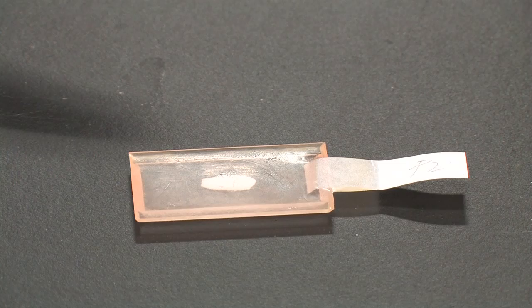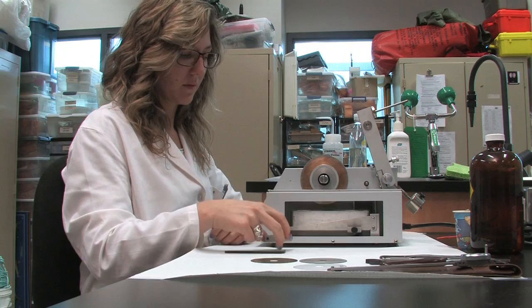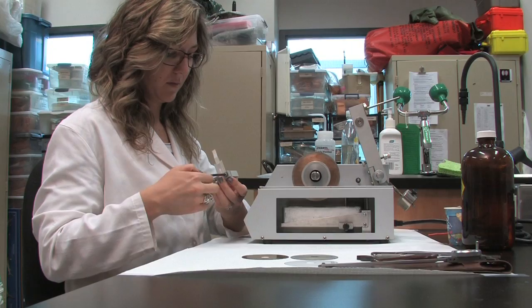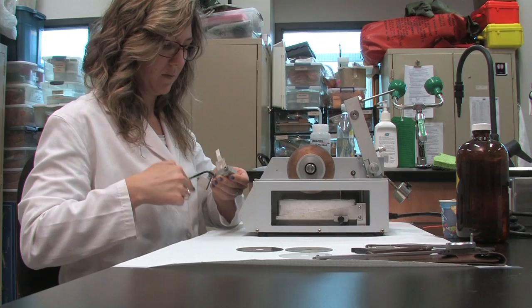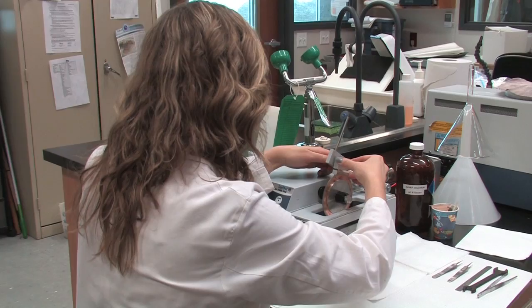Individual otoliths are typically embedded in epoxy first. Preparations for embedding otoliths in epoxy molds will be described in a separate video, Individual Embedding of Otoliths in Epoxy Molds. The epoxy provides support around the otolith while cutting and makes them easier to clamp in the chuck. Place the embedded otolith in the single chuck, tighten with an Allen key, and attach it to the cutting arm with the screws facing down. Insert the retaining screw to secure the chuck to the cutting arm.